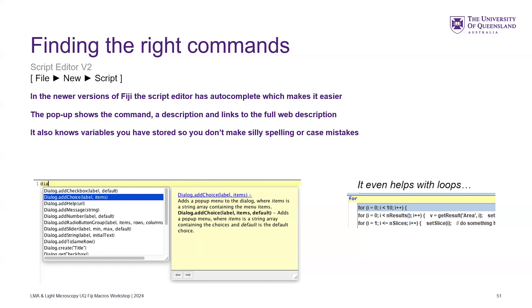As some people may have noticed, especially with the last exercise, for common things it will auto-populate. If you start typing 'for', it'll give you a little generic follow-up, or it'll do ones for like how many results, how many slices. So that's really helpful.